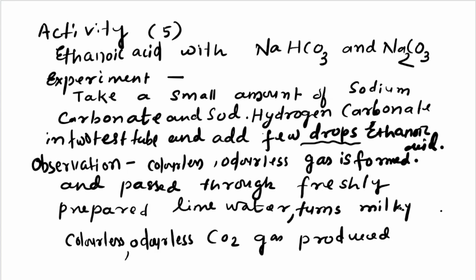Activity 5. Here you will see ethanoic acid with sodium hydrogen carbonate and sodium carbonate. What is the formula of sodium hydrogen carbonate?